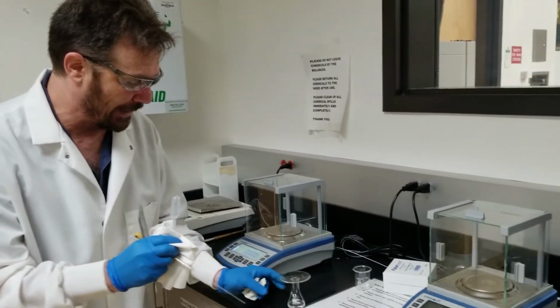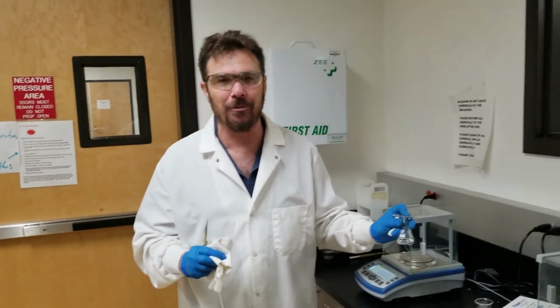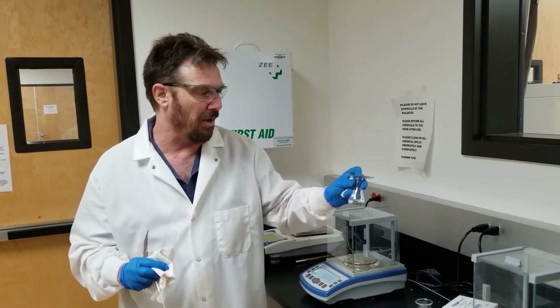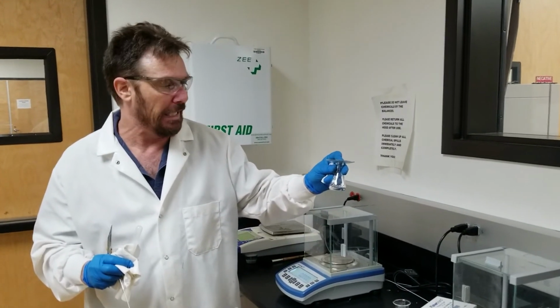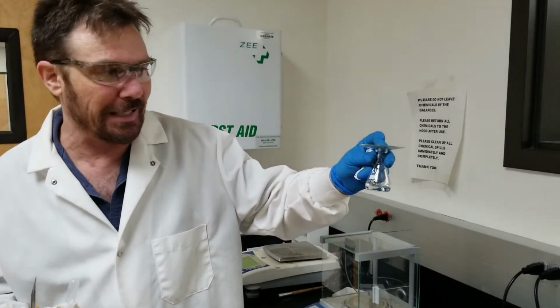And so we're going to take this, we got it capped up, and it's hard to describe. We've been trying to figure out that there's a very distinct aroma that's coming off of this cyclohexene. It's volatile, so we want to keep it nice and capped up. And let's go take an IR of this.